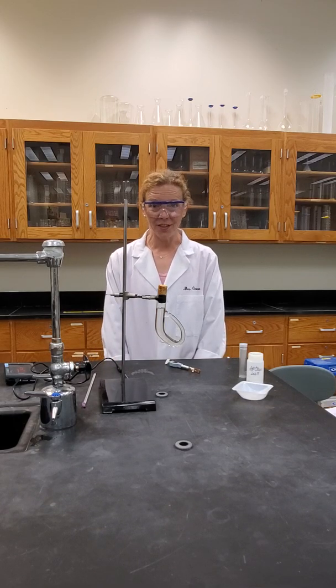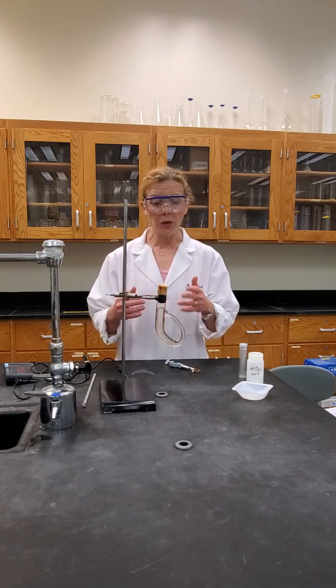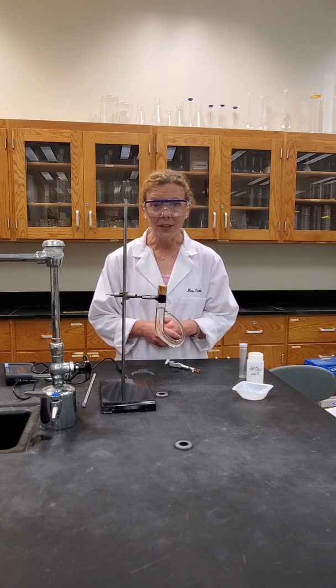Melting point determination. This video will address how we will use a Thiel tube to measure the melting point of a compound, of a solid.